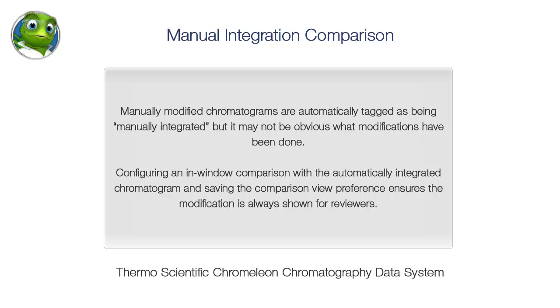Manually modified chromatograms are automatically tagged as being manually integrated, but it may not be obvious what modifications have been done. Configuring an in-window comparison with the automatically integrated chromatogram and saving the comparison view preference ensures the modification is always shown for reviewers.